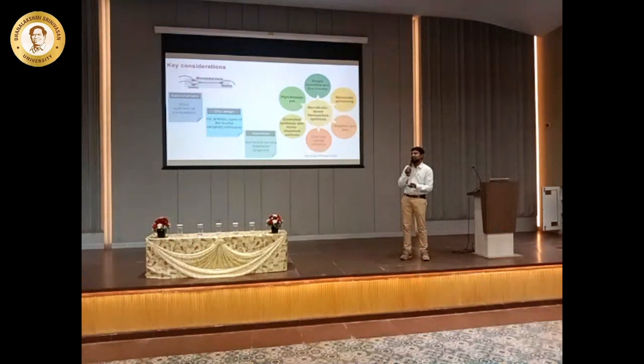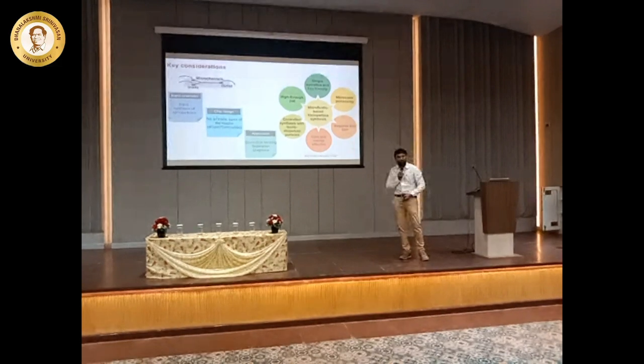They don't need to understand your reaction, biologist, because we have been talking about this, we have several doctors who ask you, see, you prepared me material, last week you gave one size of material and today you give another size of material. This is not going to work, and the previous one was working, give me the previous one. And we don't have control over the reactions. This control over the reaction can only come by using microfluidic devices. So you give them a device, you ask them to make it, and then they are happy and you make the patients happy, right?